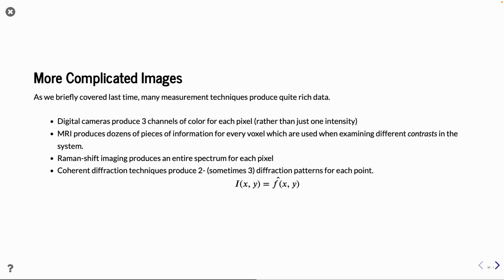You have the Raman shift, which actually produces a whole spectrum behind each pixel. And when we want to look at these images, we may have to introduce more complicated methods for the segmentation. Then a single threshold is a bit tricky, because you go into some multi-dimensional space. For that, I'm going to show you a couple of methods that we can work with.